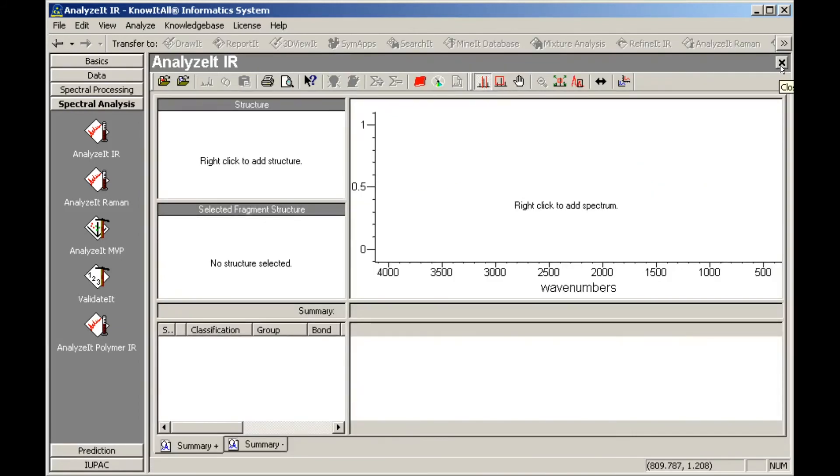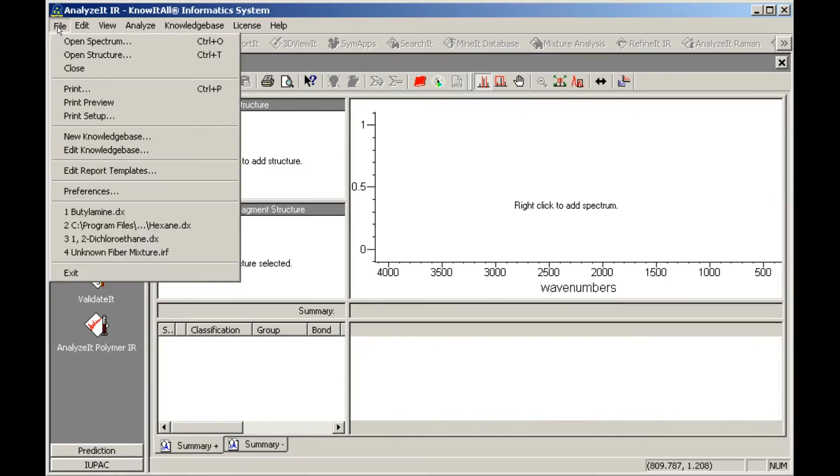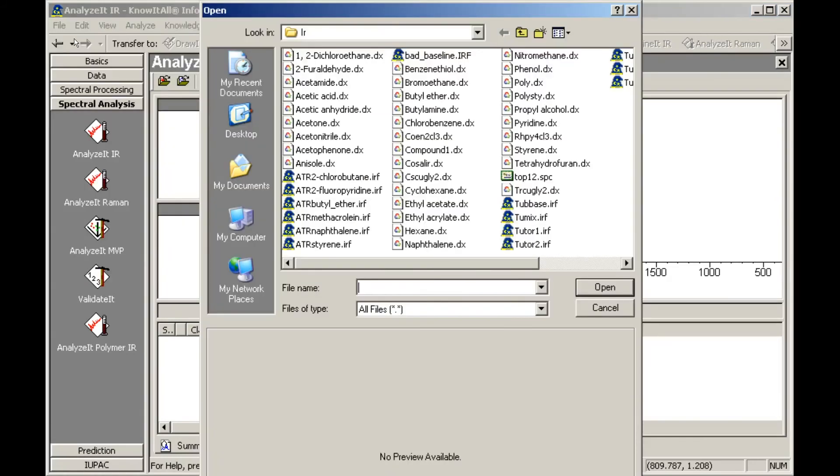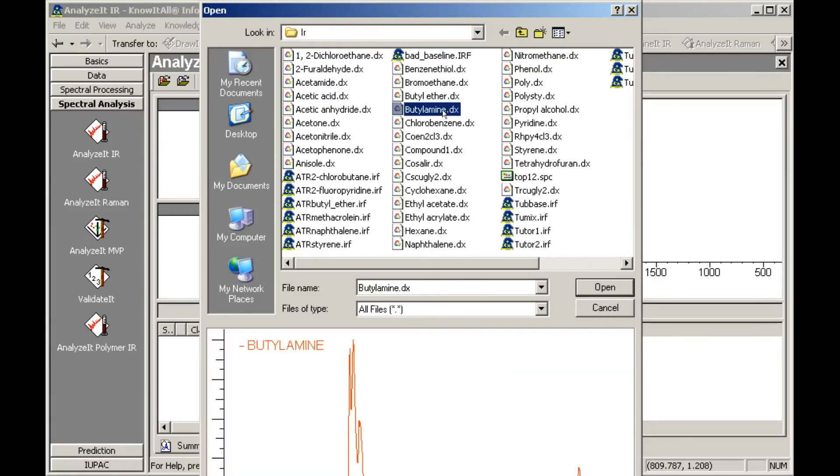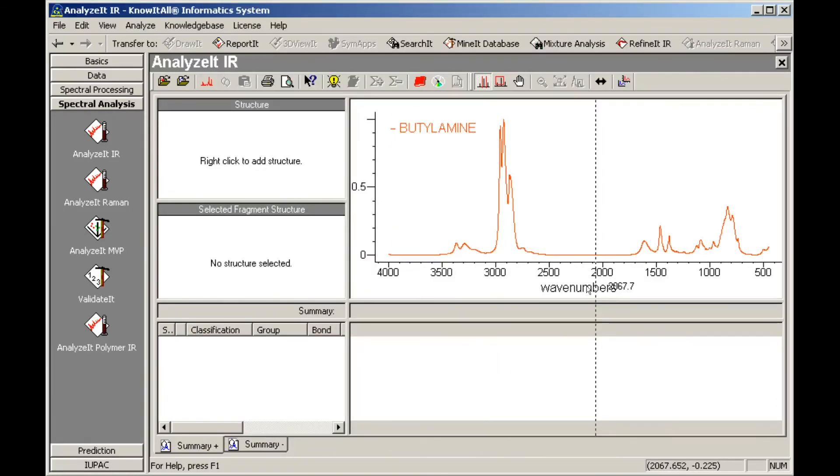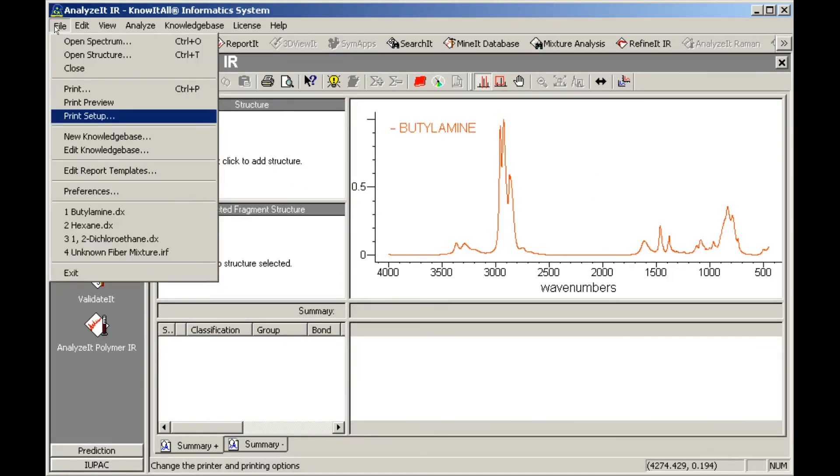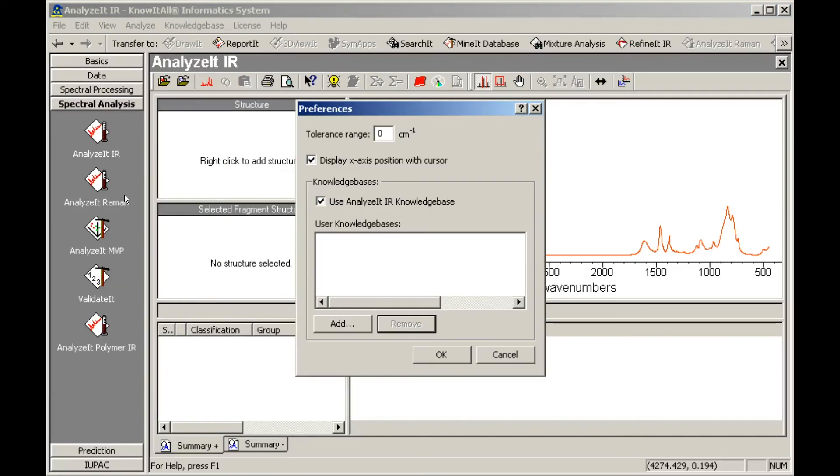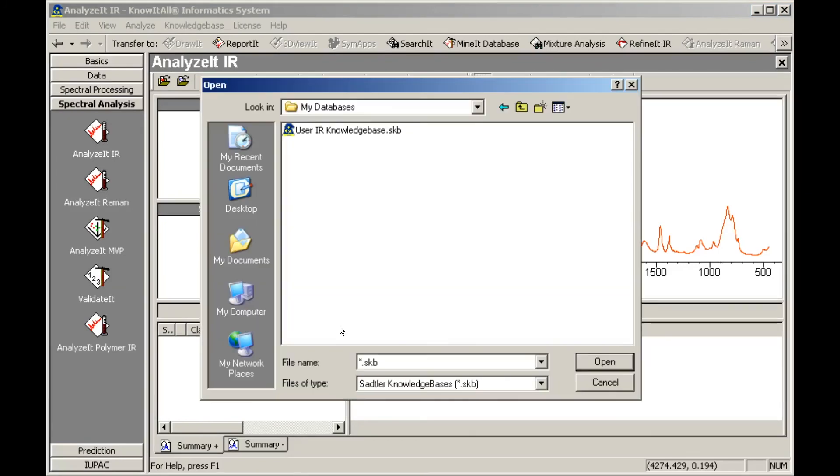Next we demonstrate how to use the new user knowledge base. Open the butylamine sample file. Then, open the Preferences dialog box and click Add. Browse to and open the newly created user knowledge base.